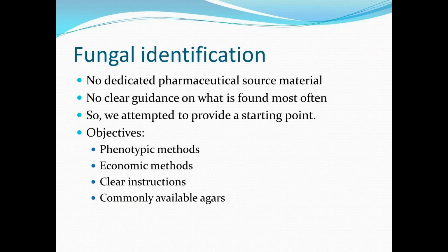Our objectives were to use phenotypic methods, to use methods that were not too convoluted in terms of time or money, to provide clear instructions, and only to use agars that were actually commonly available. We also wanted our approach to be suitable for use worldwide.